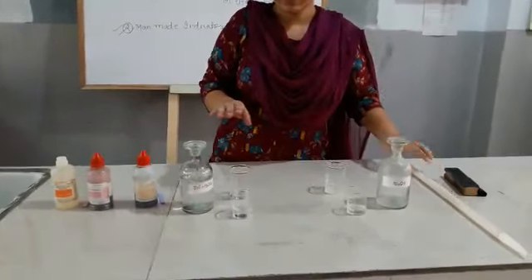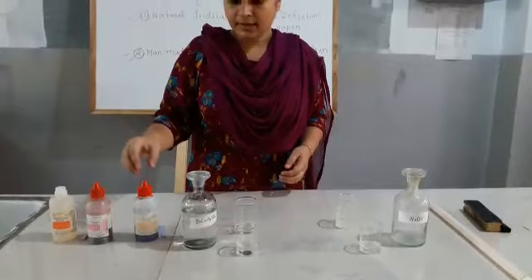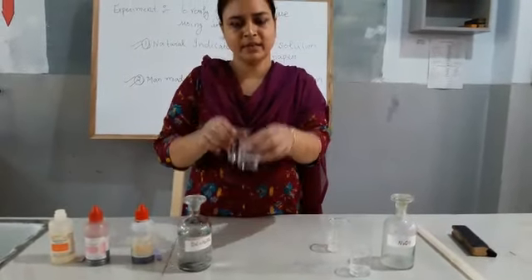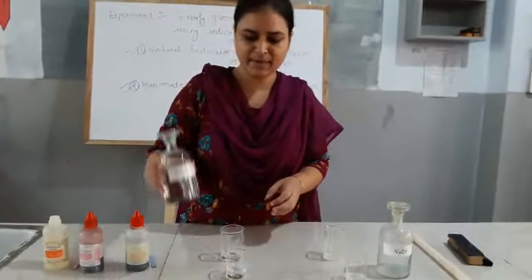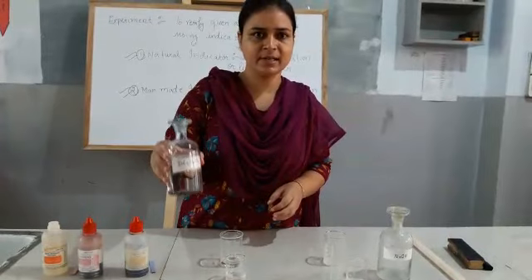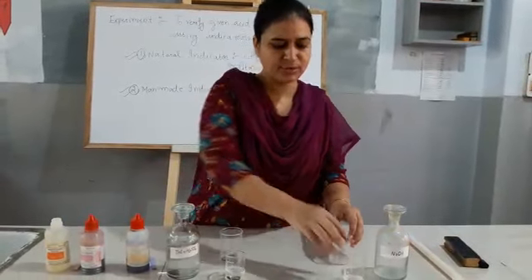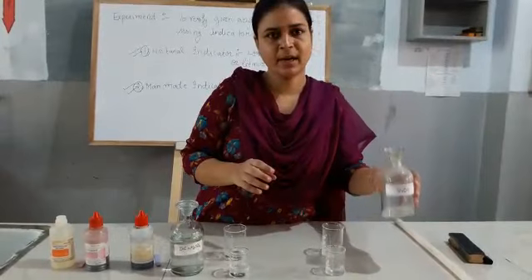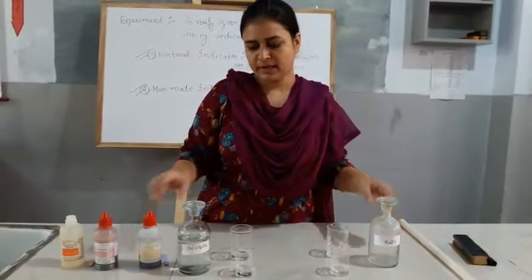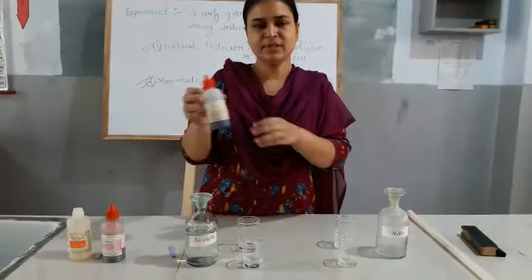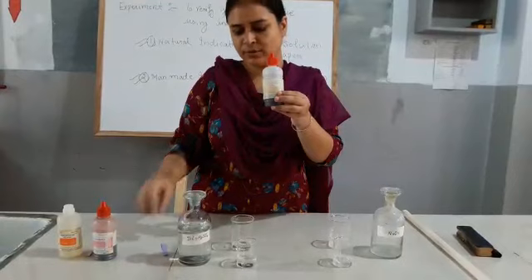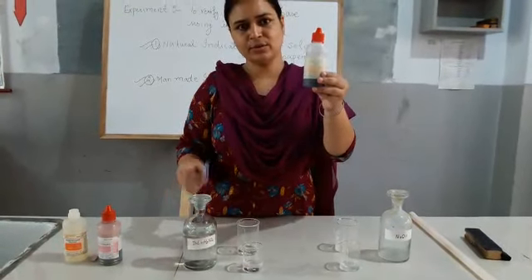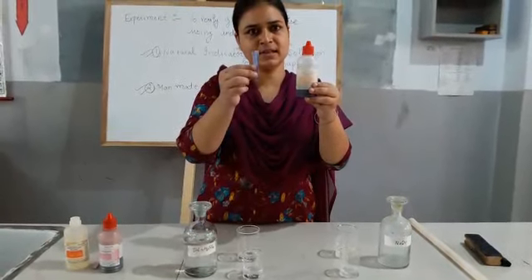Here you can see the apparatus used. I have taken two beakers — in these two beakers, this acid is present, named sulfuric acid. And in these two beakers, I have taken a base, that is sodium hydroxide. In indicators, I am using litmus solution blue, which is available in two forms: solution as well as the strip form.